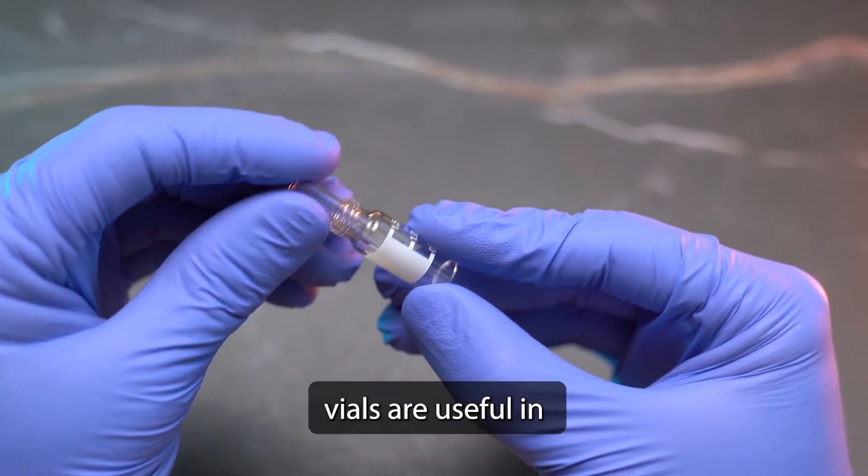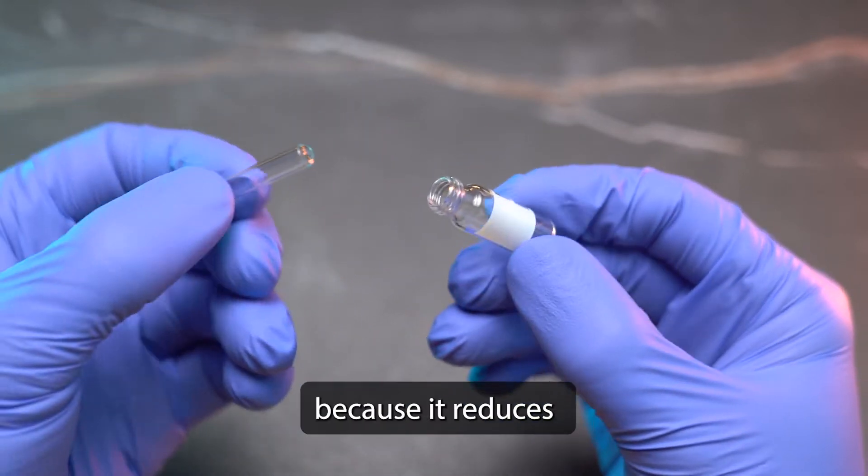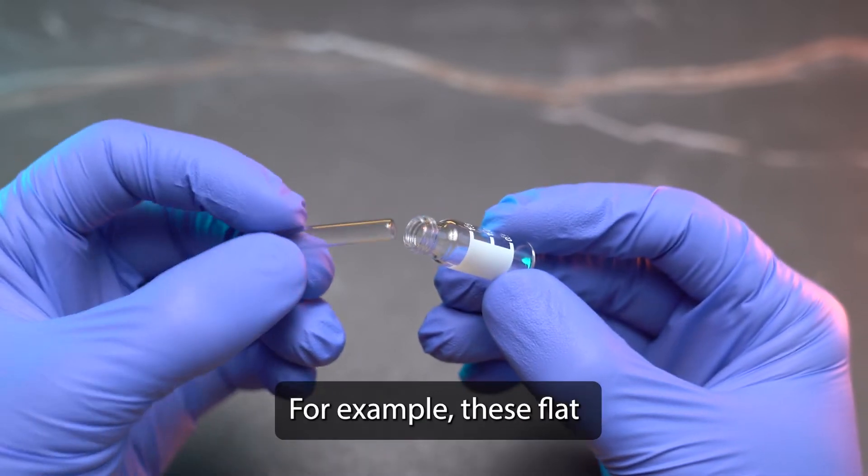Inserts for your HPLC vials are useful in helping to recover the sample because it reduces the volume inside. For example, these flat bottom glass inserts have the largest capacity for filling up your sample.